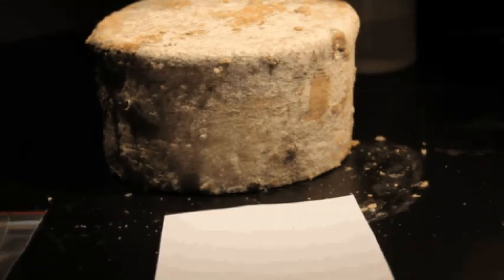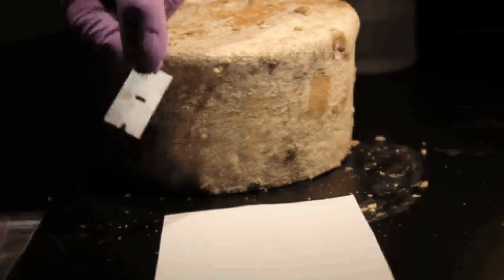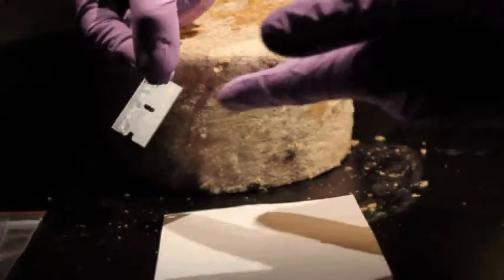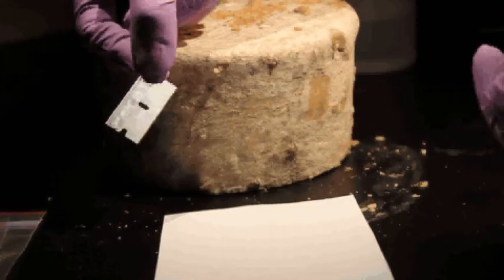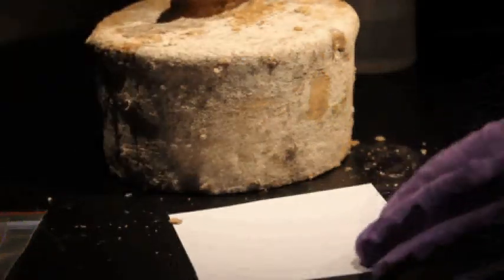To scrape the rind of a natural rind cheese, you'll need a few materials. You'll need something sharp, like a razor blade — hopefully a clean one that hasn't been used on a cheese before. You'll also need a piece of paper to collect the rind sample, your cheese, and a plastic bag to put the sample in.